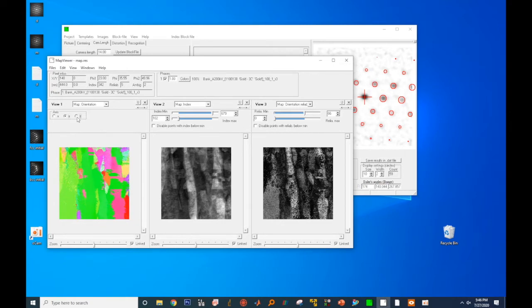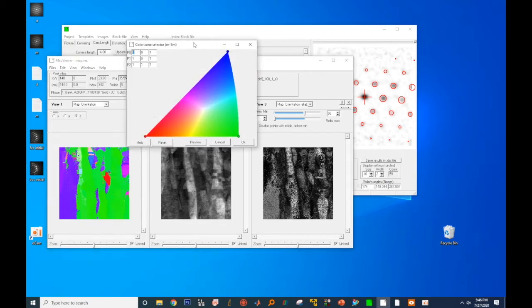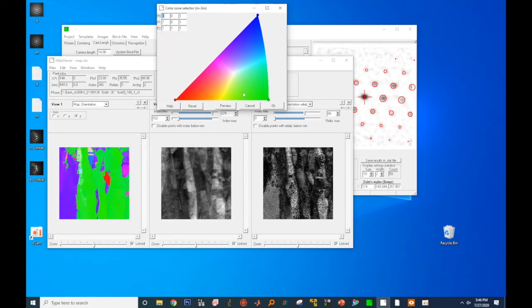To find out the orientation corresponding to each color, you can move your cursor to the tab called Colors and click on that. The colored triangular shape inverse pole figure will appear. Cross it to exit.